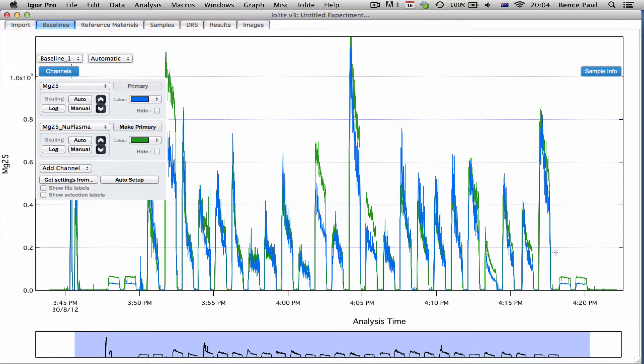Click done and we can see in the window here that it has now synced the two.